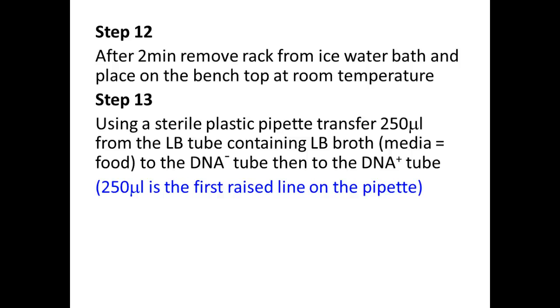And so we'll look at the pipettes, and if you take the lids off your bins, go ahead and take your lids off your bins. Taped to the inside of your bin is one of those pipettes with the markings on it that let you know the different markings and what they stand for. This pipette you're obviously not going to use. I have it taped there so that you can look and feel. The other pipettes you'll notice in your bin are wrapped because they're sterile. We do not want to touch these with our fingers, just the bulb, right? Otherwise they no longer will be sterile.